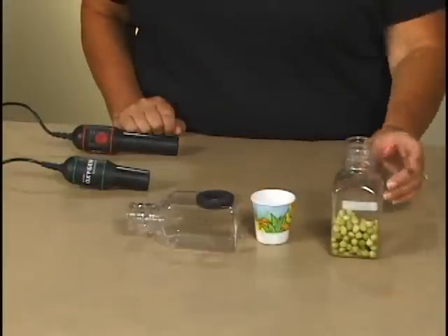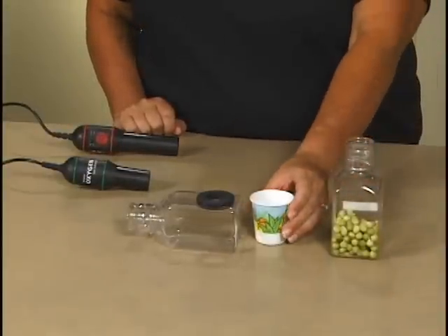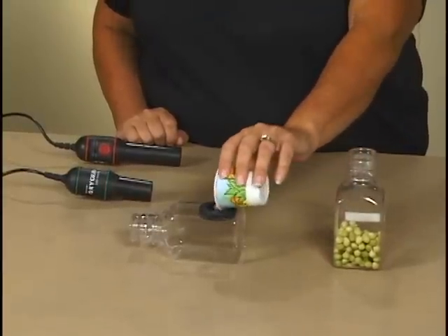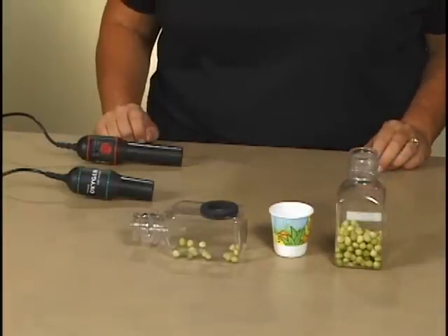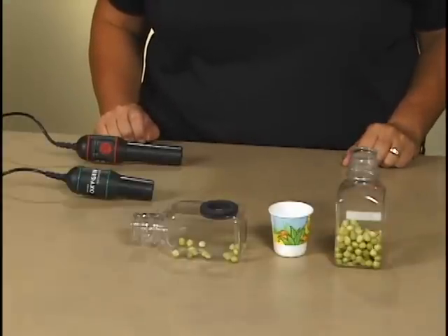I have some peas that have been soaking for a few days and have started to germinate. Measure out 20 to 25 peas and place them in the respiration chamber. Put your sensors into the biochamber — this is a biochamber 250 that allows you to use both the CO2 and the O2 sensors at the same time.